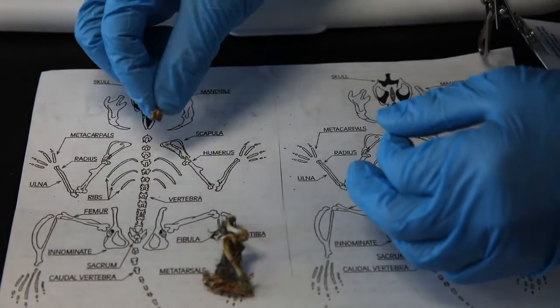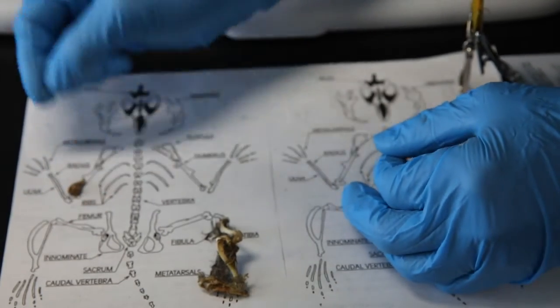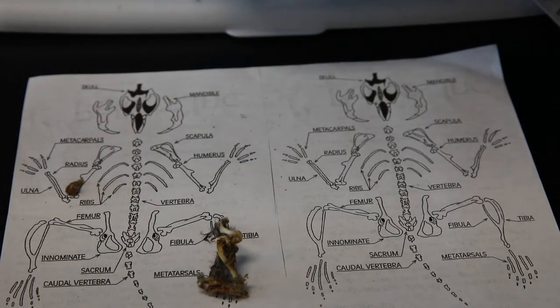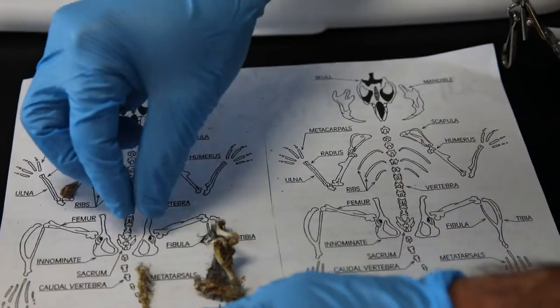What do you think? Here? Yeah, it looks good. Here? Looks good. Part of it. Wow, this owl didn't digest his food too well. I see some red meat there. I don't want to break this one up, sorry, Dave, but that's cool right here.